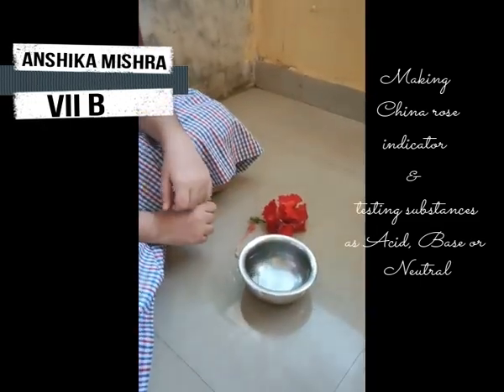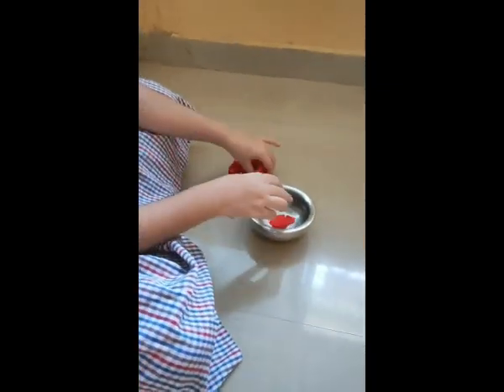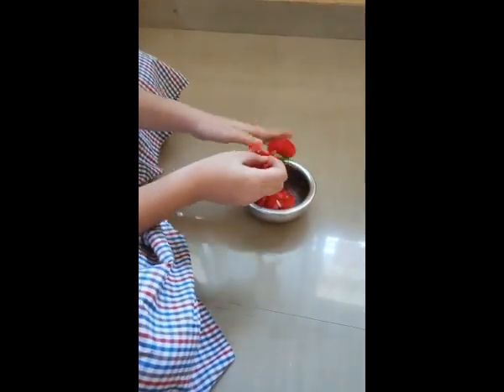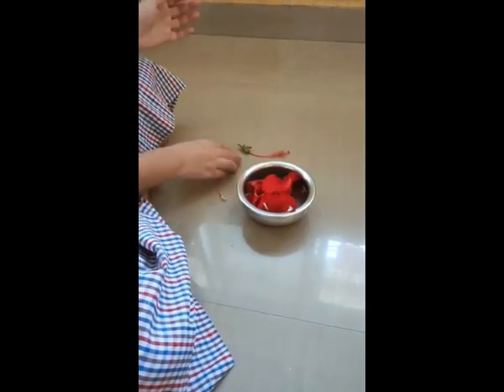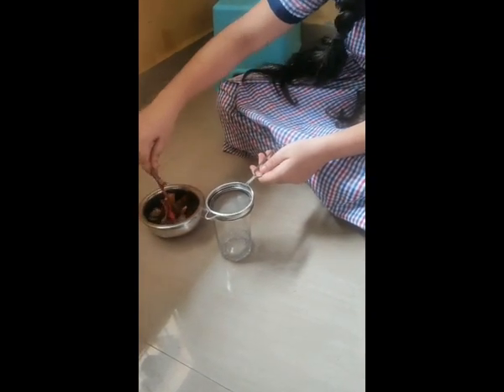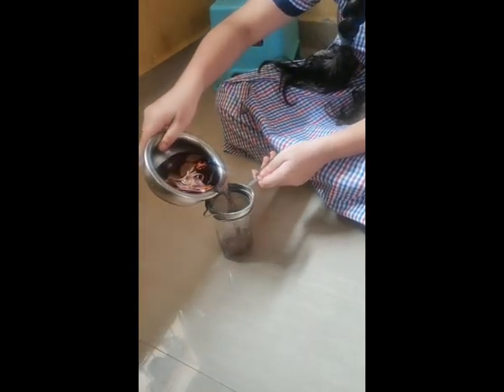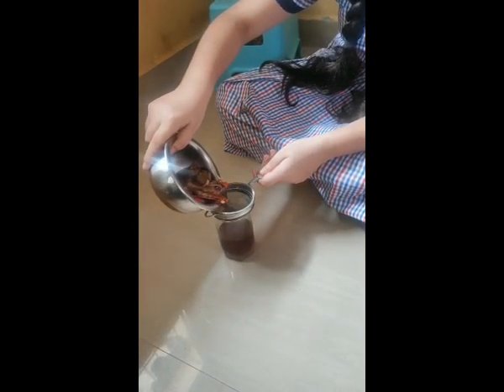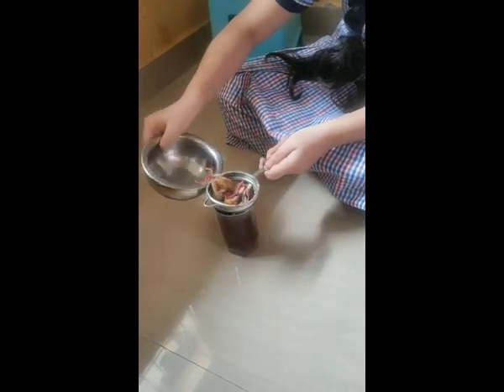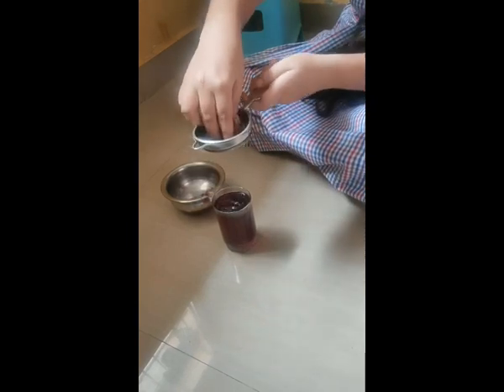To perform this, firstly we need to make China Rose Indicator. For making China Rose Indicator, take some lukewarm water and soak petals of China Rose in it. For some time, you will see that the petals have released their color. Now we need to strain them. As you can see, our indicator is ready.